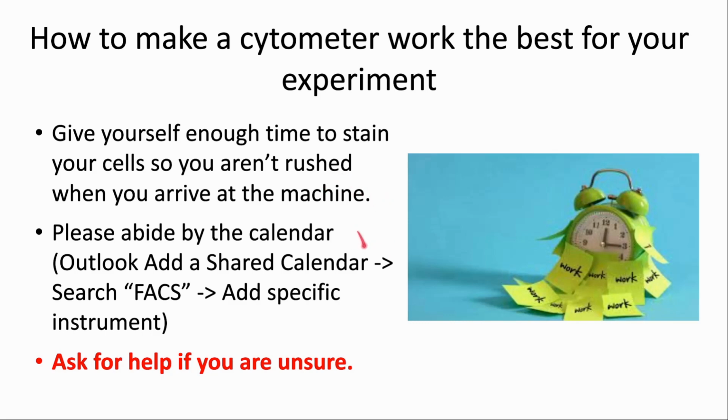Please abide by the calendar. Our current calendars are shared calendars under Outlook, and we have many users of the machines who all need to get their experiments done. Assume at least 2 to 3 minutes collection per sample.